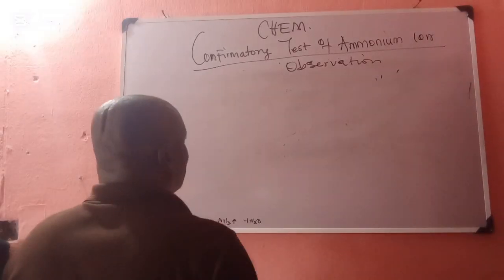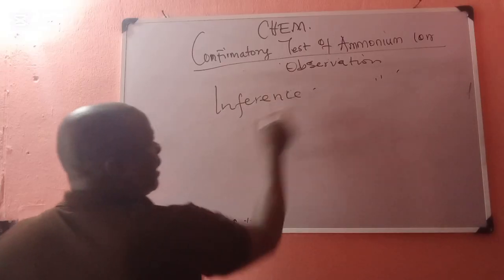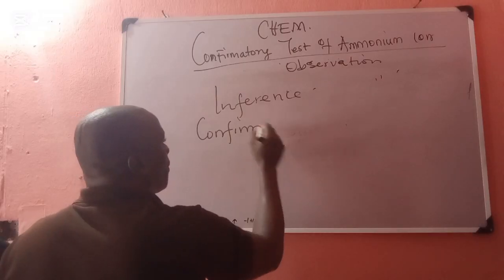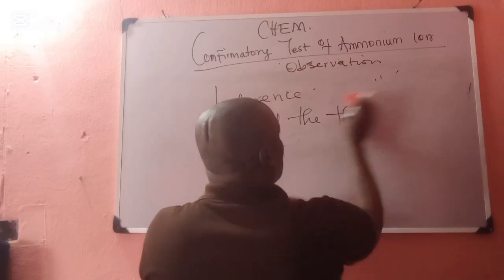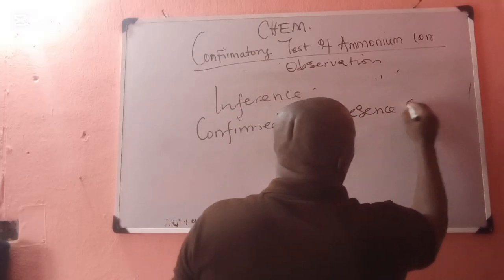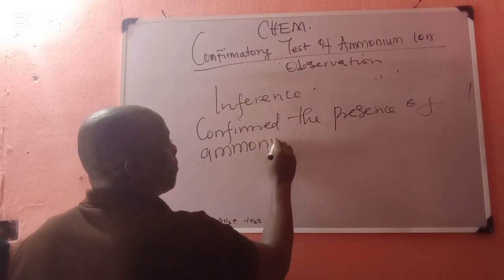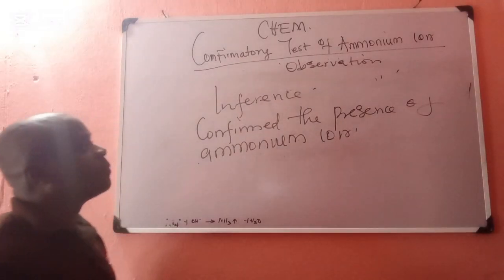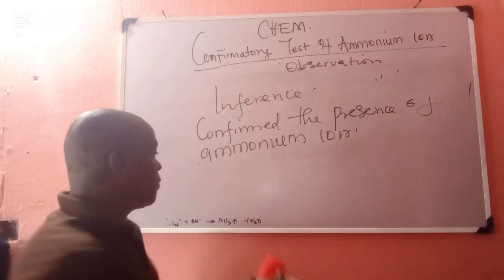Under our inference, this confirms the presence of ammonium ions.